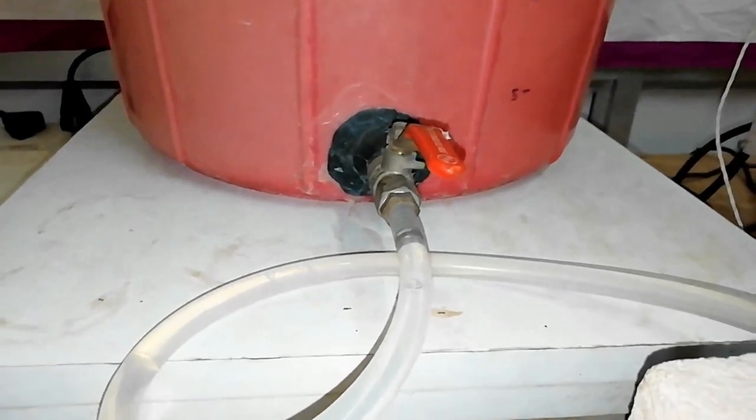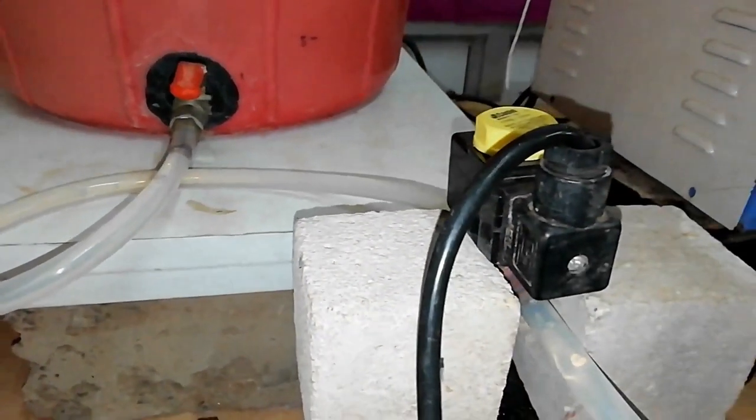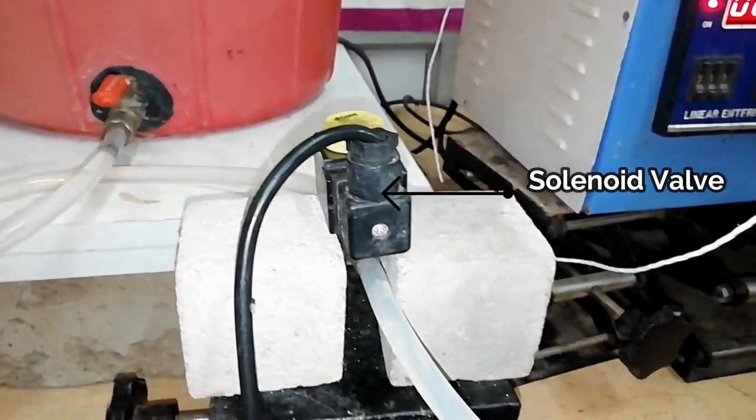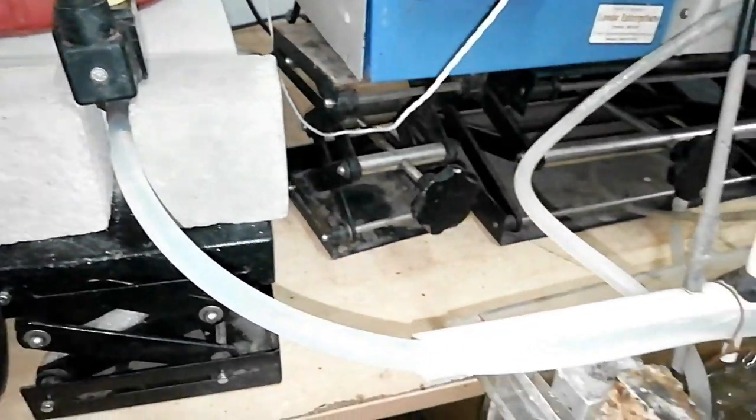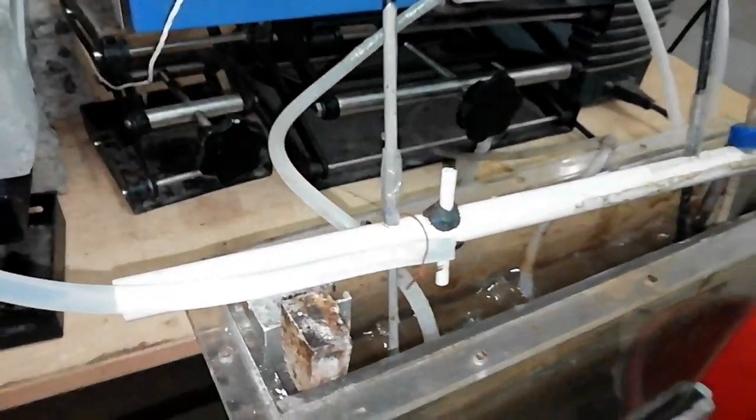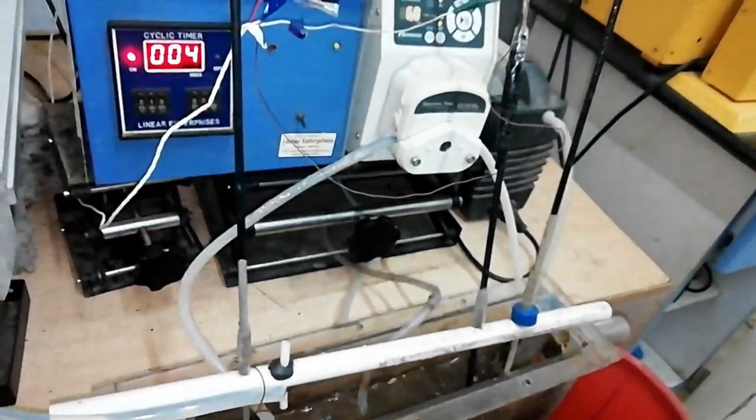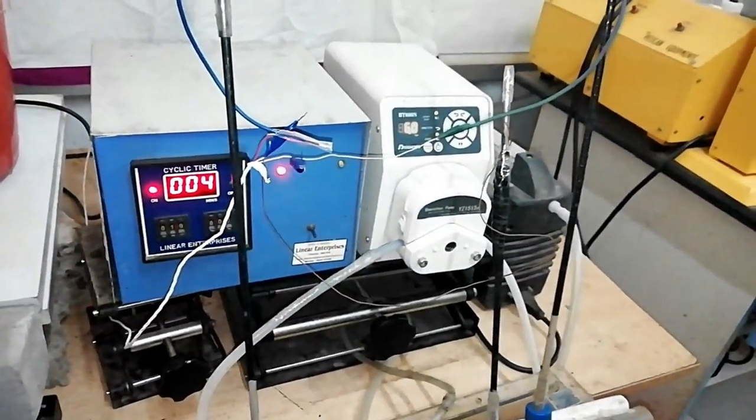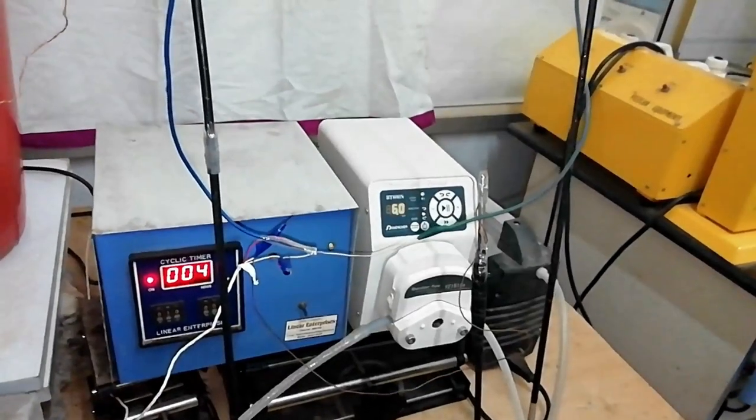Influent enters into the MBR and the flow of the influent is controlled by a solenoid valve. The solenoid valve gets the signal from the level sensor. When the level of the wastewater goes down, the level sensor gives a signal to the solenoid valve and wastewater enters into the MBR.